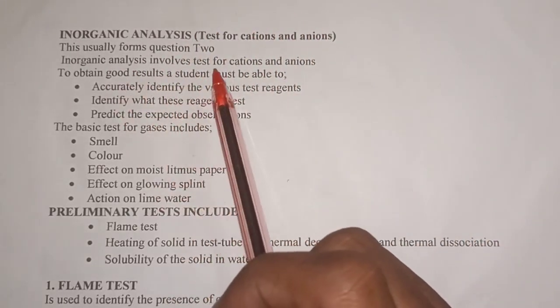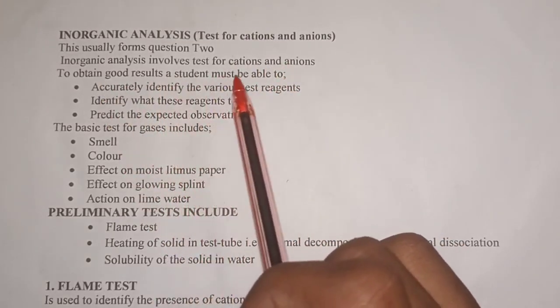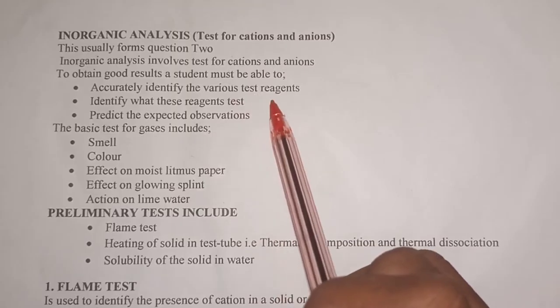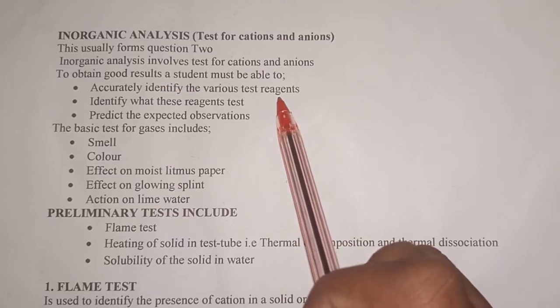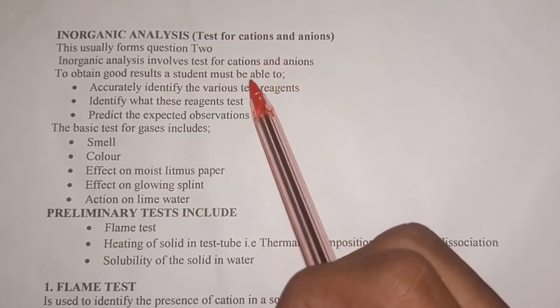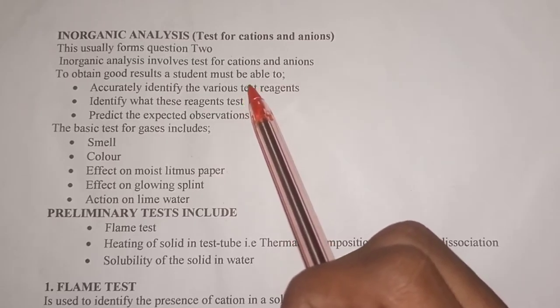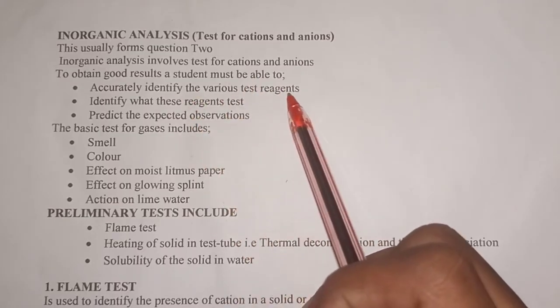Now, inorganic analysis involves tests for cations and anions. For the student to obtain good results, they must be able to, number one, accurately identify the various test reagents that are used. When you're given the paper and you know that the question is testing for cations and anions, you must understand which reagents are used for which test. Some of the reagents that you usually use are sodium hydroxide, aqueous ammonia, lead nitrate, barium nitrate, and so on. So you must be able to identify the various test reagents.